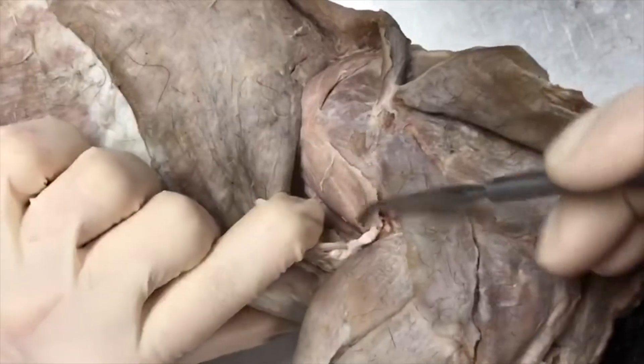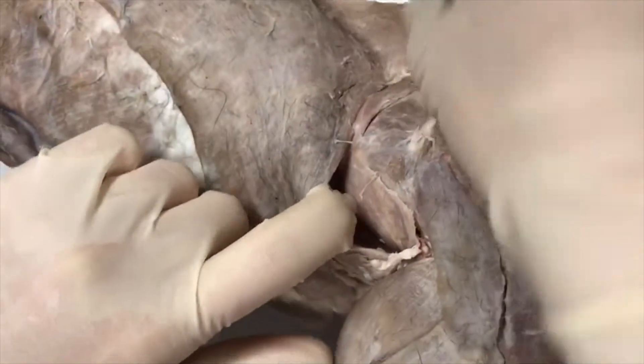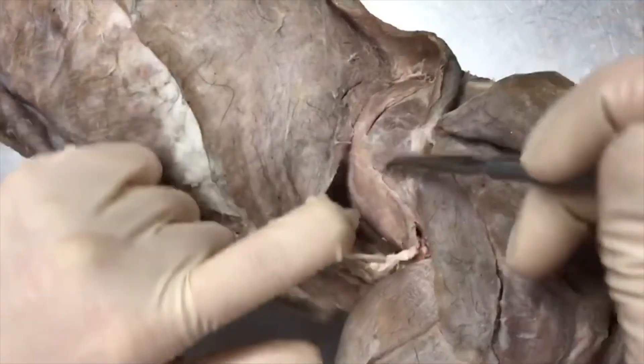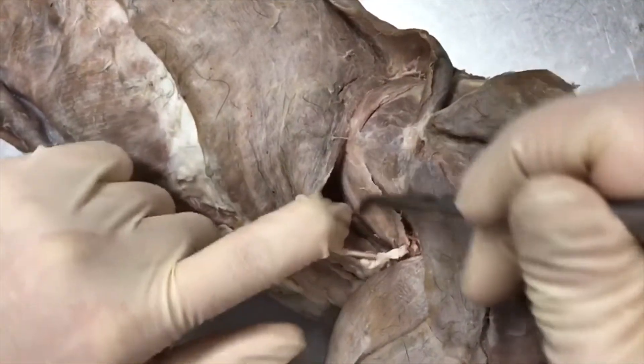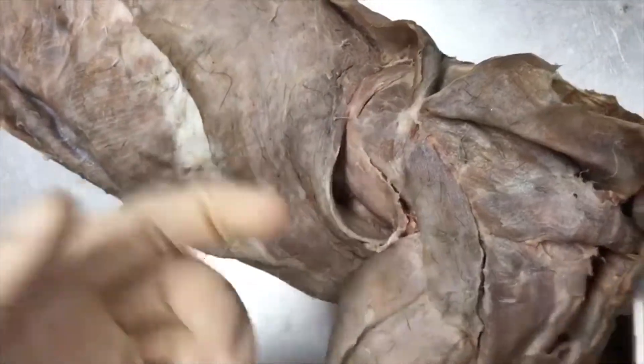If we flip the cat on the side, this muscle over here, underneath your lat and a little bit of your spinal trapezius, is going to be your teres major. You're unable to see your teres minor unless you remove the arm.